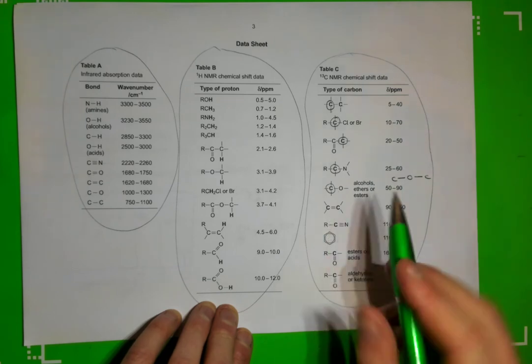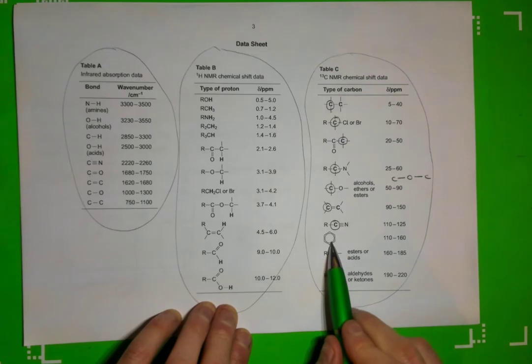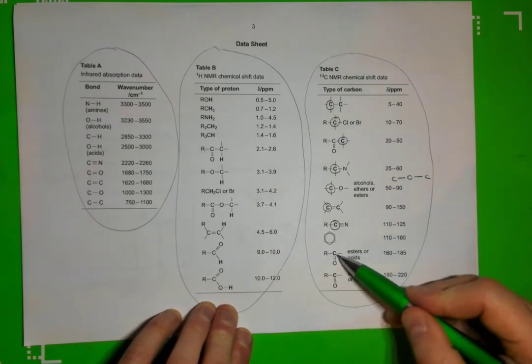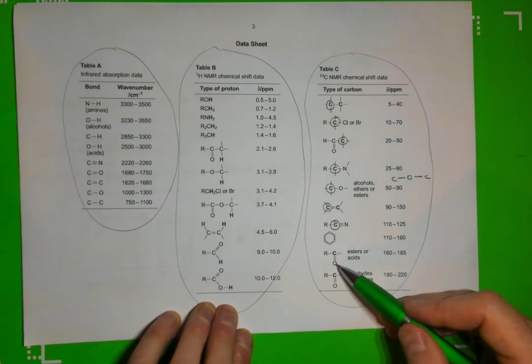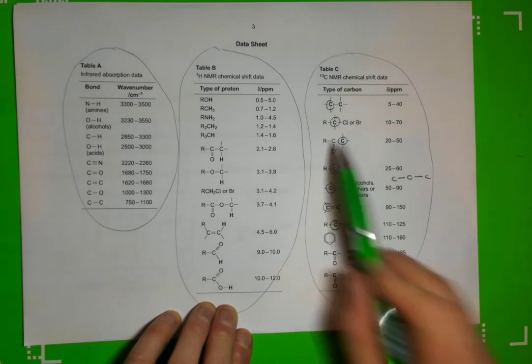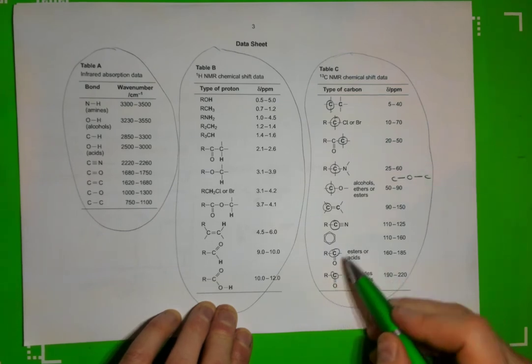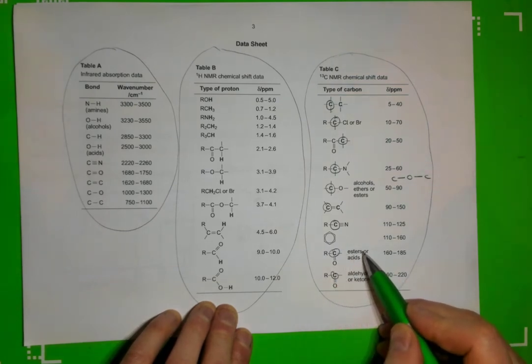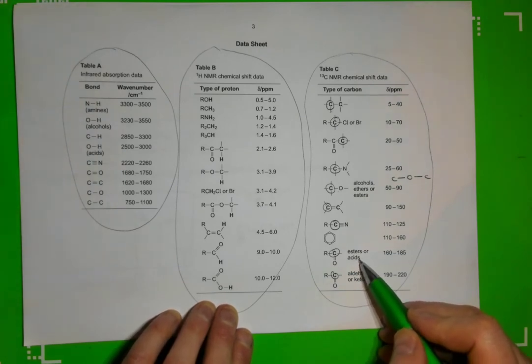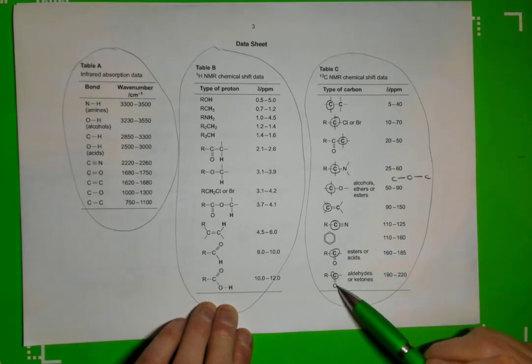This structure here is where we've got an alkene. Here is a nitrile. This is to do with a carbon in a benzene ring. And here is the carbon directly bonded to a double bond oxygen. So whereas this one here was the one next to it, this one here is within the bond. However, we've got 2 of these. The top one here is for esters and carboxylic acids. Just says acids there. It does actually mean carboxylic acids. And this one here is for aldehydes and ketones.